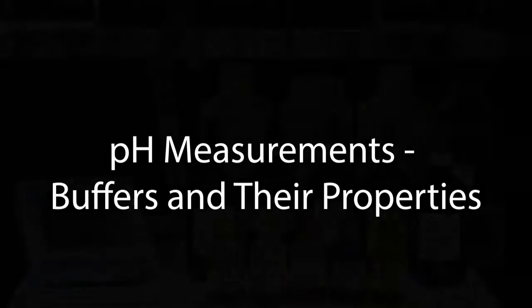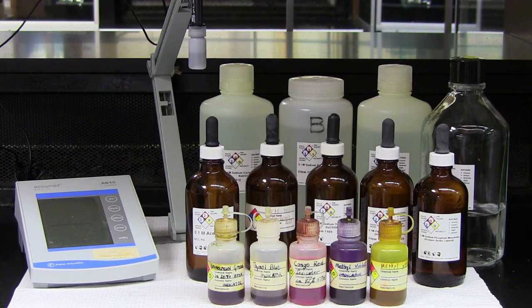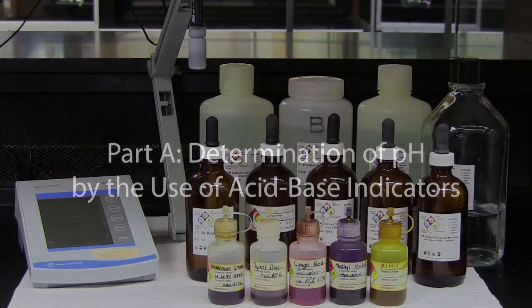In this experiment, you'll determine the approximate pH of several solutions by using acid-base indicators. Then you'll find the pH of some other solutions with a pH meter. Finally, we'll prepare a buffer system.